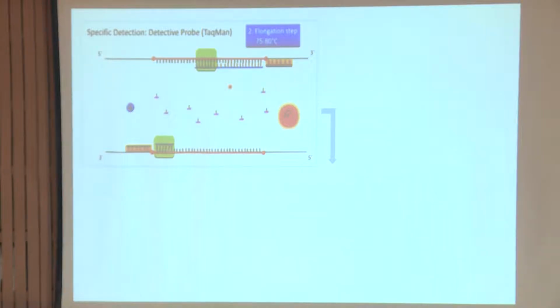So just imagine at the start of your real-time PCR, you added the probe together, much like your primer you added. There is a probe, there is a quencher, there is a reporter, nucleotides, and as the amplification progresses, it starts binding with the target and getting disintegrated after the primer binding and primer extension, right?